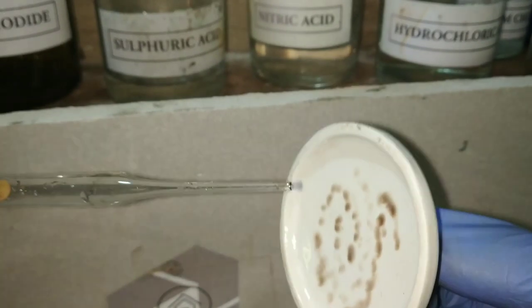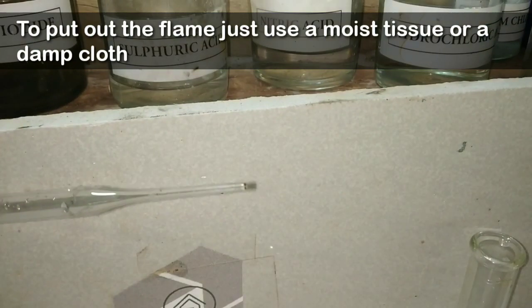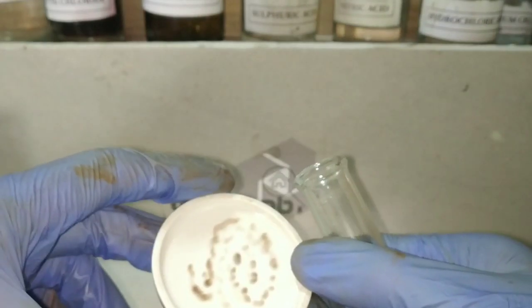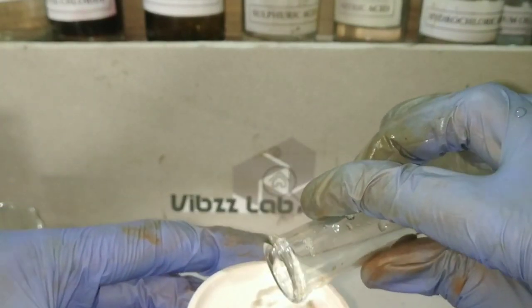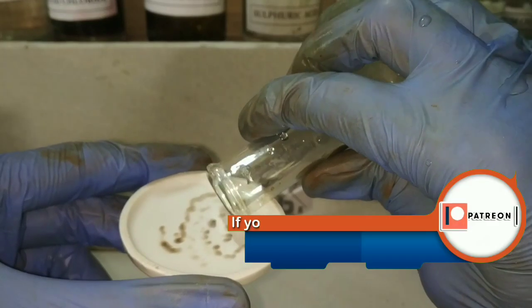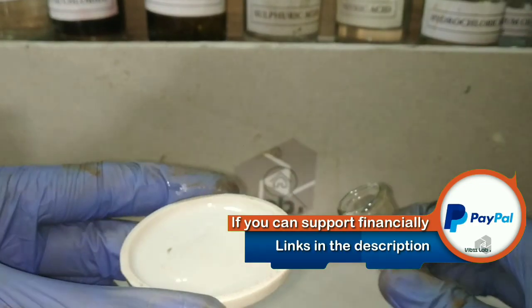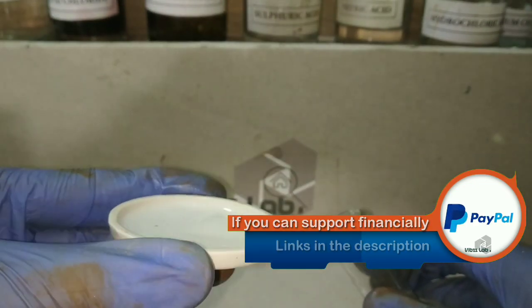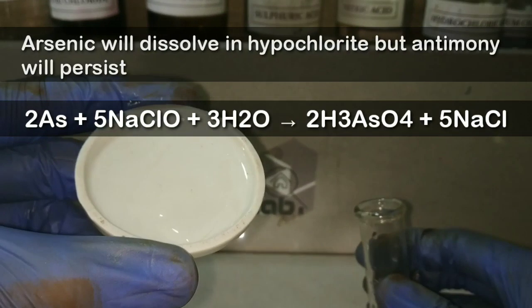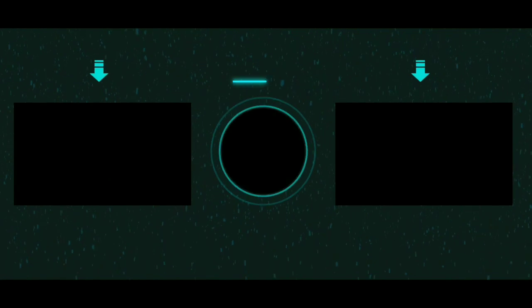Arsine is highly poisonous — avoid inhalation of the vapors, use a respiratory mask, and to put out the flame just use a moist tissue paper or a damp cloth. Now, antimony also gives a false positive Marsh test. To differentiate, we add a little amount of sodium hypochlorite solution into the porcelain dish containing the elemental deposit. If it was antimony it would not dissolve, but arsenic metal dissolves in hypochlorite giving arsenic acid H₃AsO₄, while antimony will not dissolve.